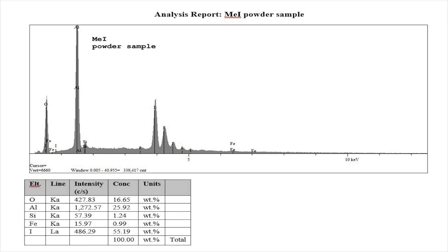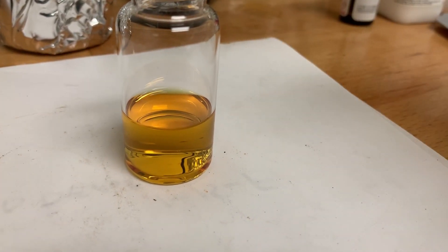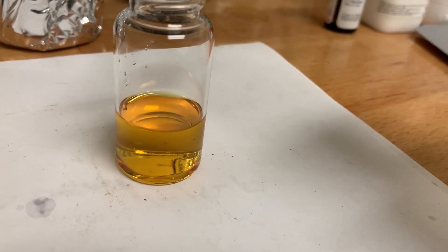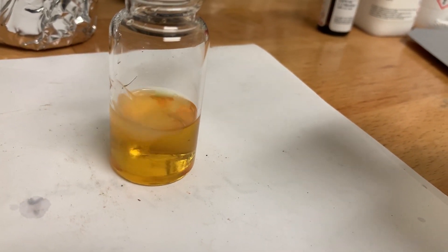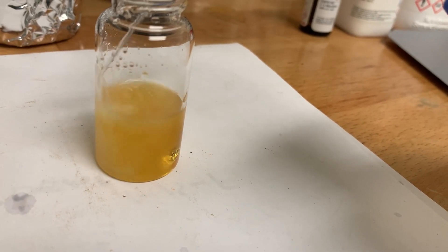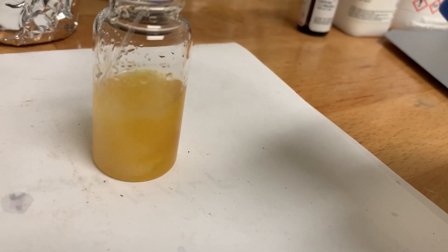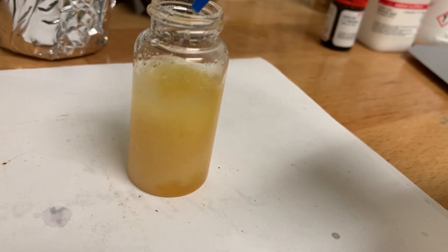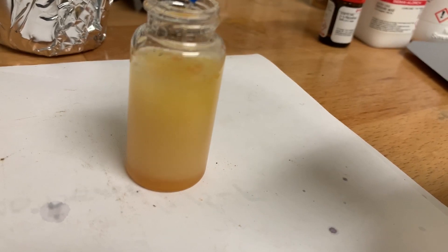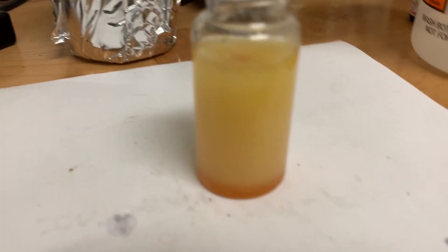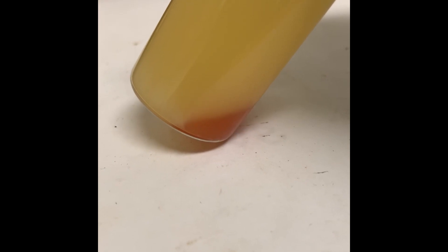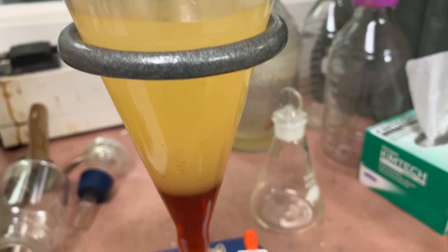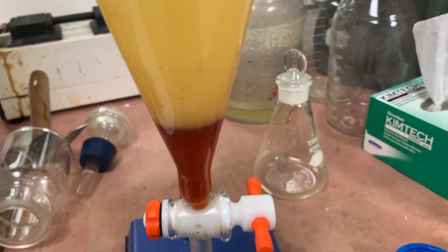I took a small sample of the distillate and I'm adding water to it here to check and make sure that it causes a phase separation to occur, which tells me that I very likely have methyl iodide in this sample. After letting it sit for a while, there's a clear phase separation, which means I very likely have methyl iodide. I then placed it in a separatory funnel and separated the organic phase, which is on the bottom.